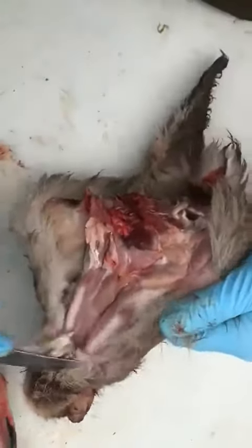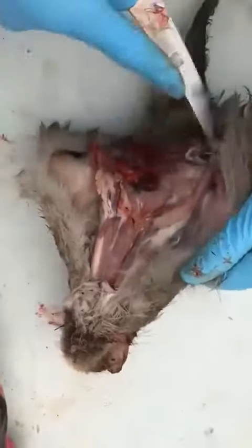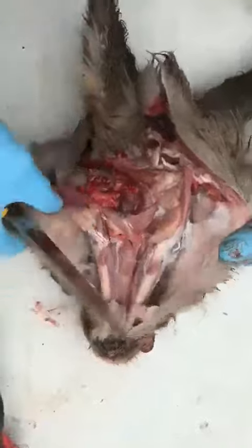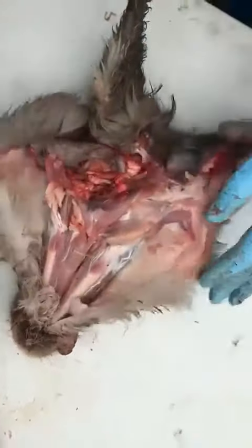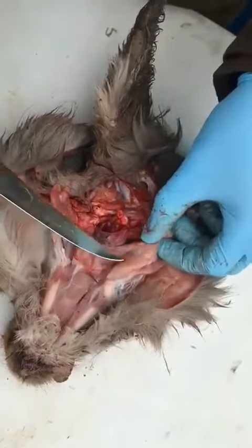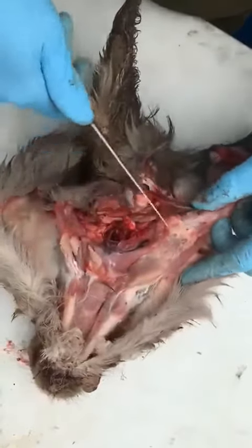There we can peel back the skin on this side. There you have it. This here is the lymph glands that are on the neck.